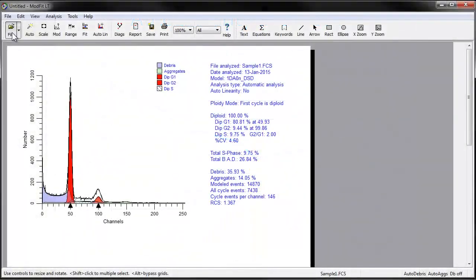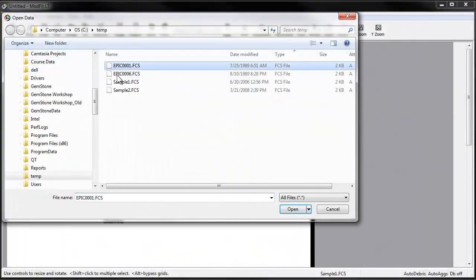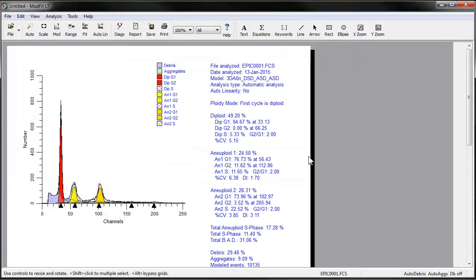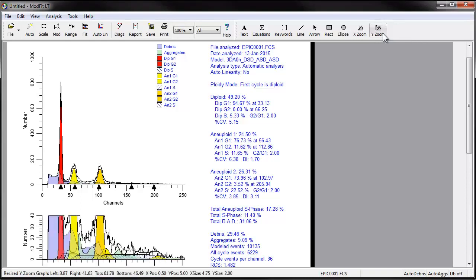Let's open a file for which the default linearity value of 2 is too high. Auto-analysis of this file actually looks pretty good, but let's see what autolinearity will do. Note that the aneuploid 1 S-phase is reported as 11.66% and the RCS is a respectable 1.482. We can see that the aneuploid 2 G2M model component appears shifted to the right of the apparent G2M peak, and an aggregate peak is also shifted a little to the right.